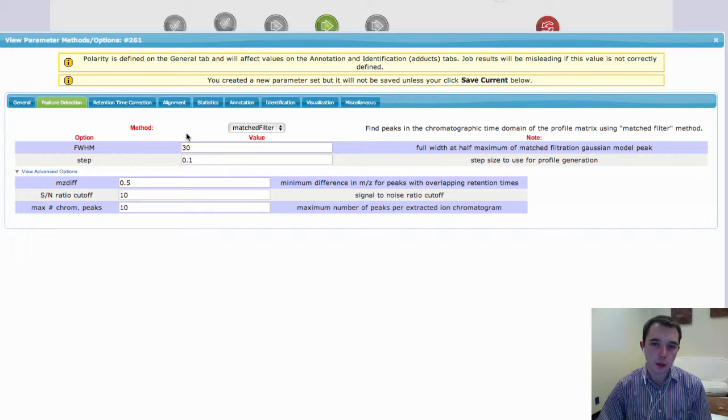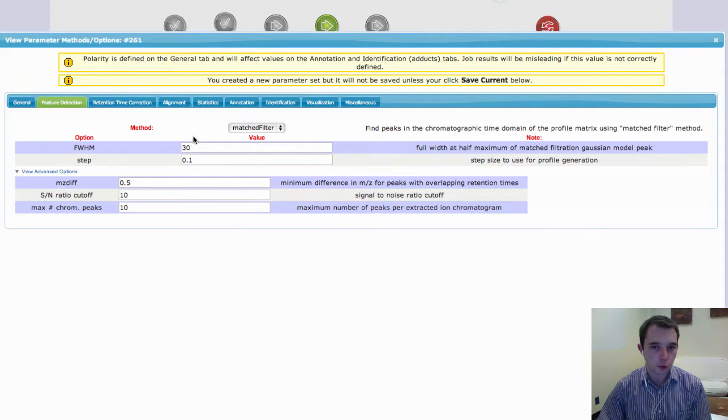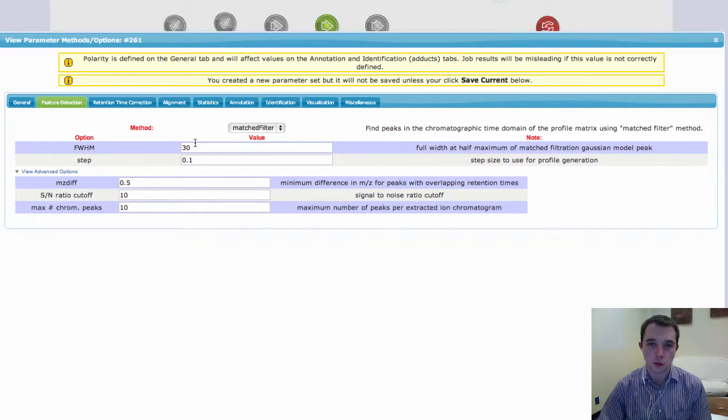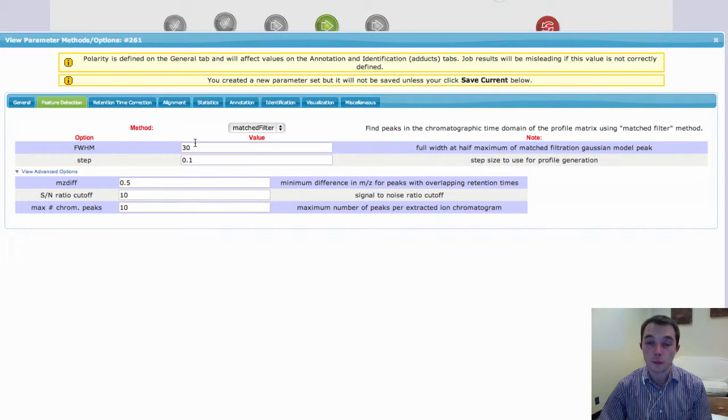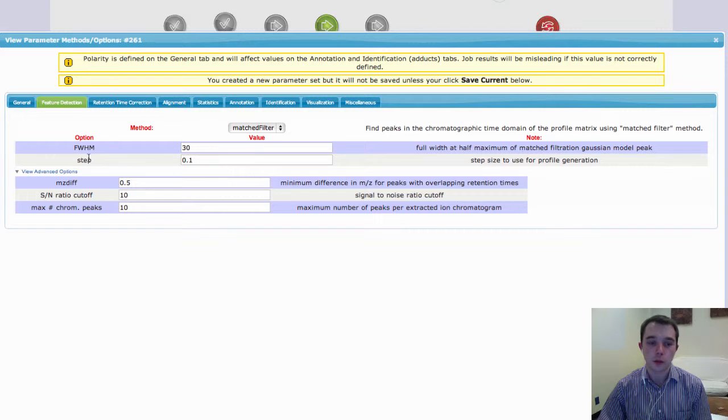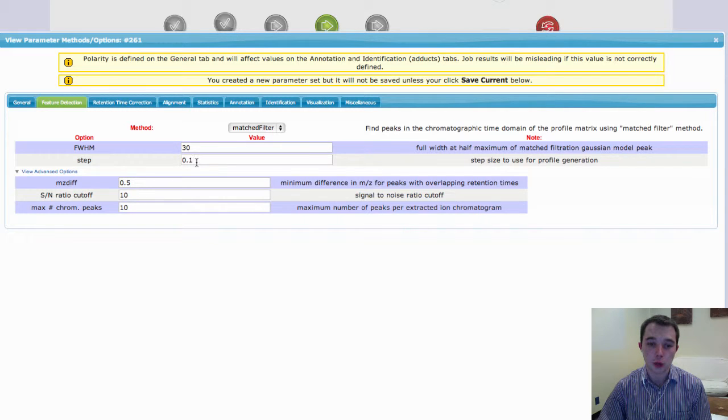So, for an HPLC data set, it's normally somewhere around 30 seconds. For UPLC data sets, you'll probably want to set this a lot smaller, probably somewhere around maybe 10 or 15 seconds. The other setting that you need to think about is your step size.